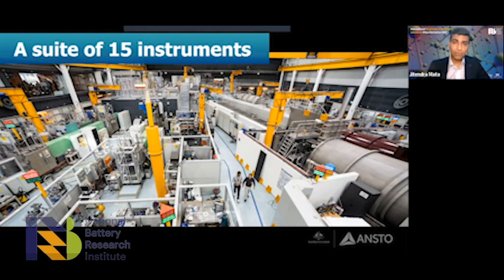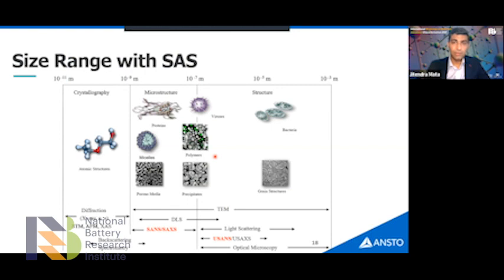So here, that was the overview of the ACNS, which is the Australian Centre for Neutron Scattering, where we have all the beamline facility. That's a part of ANSTO, and the Australian Synchrotron is a part of ANSTO as well, but that's in Melbourne. So I'm not going to cover any X-ray instrument as such, a synchrotron-based X-ray instrument.